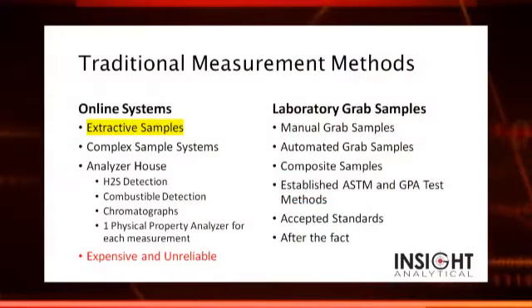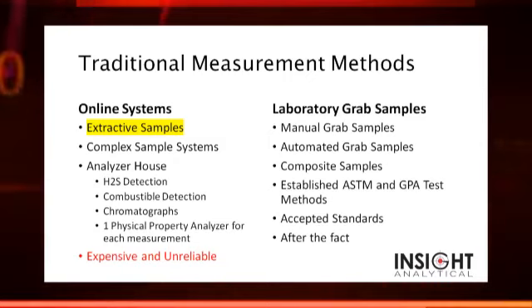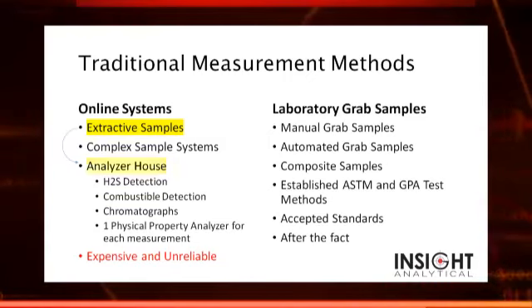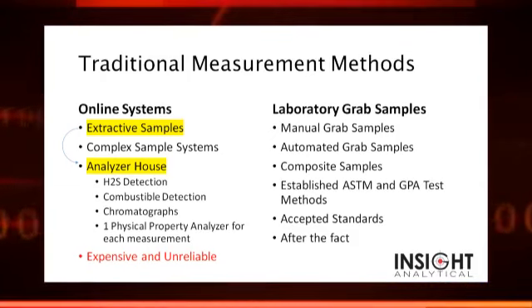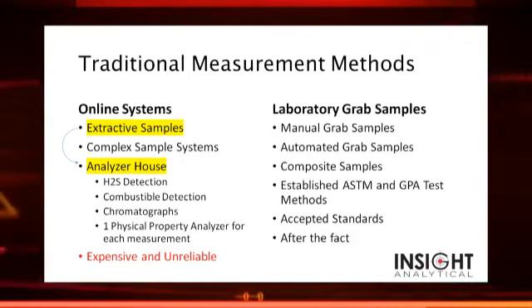So I'm going to consider not just how am I going to do the analysis, but what am I going to do with the product after I've analyzed it? We're going to have a complex sample system in place, and we're almost assuredly going to need an analyzer house there, probably with H2S detection, toxic gas detection, air conditioning, and all of these things add to the cost and the maintenance requirements.